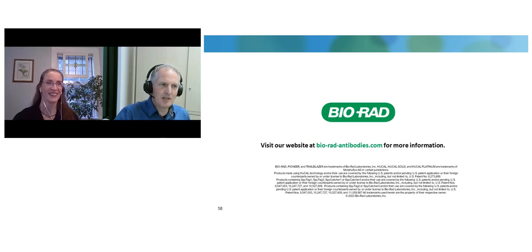So here it's important to keep in mind that we work with a synthetic library. The CDR cassettes were synthesized by trinucleotide mutagenesis. The design of the heavy chain CDR3, for example, has a theoretical diversity of more than 10 to the 25. Of course, we cannot synthesize that many heavy chain CDR3s. So what we basically get out of synthesis is about 10 to the 17. It's a huge number.